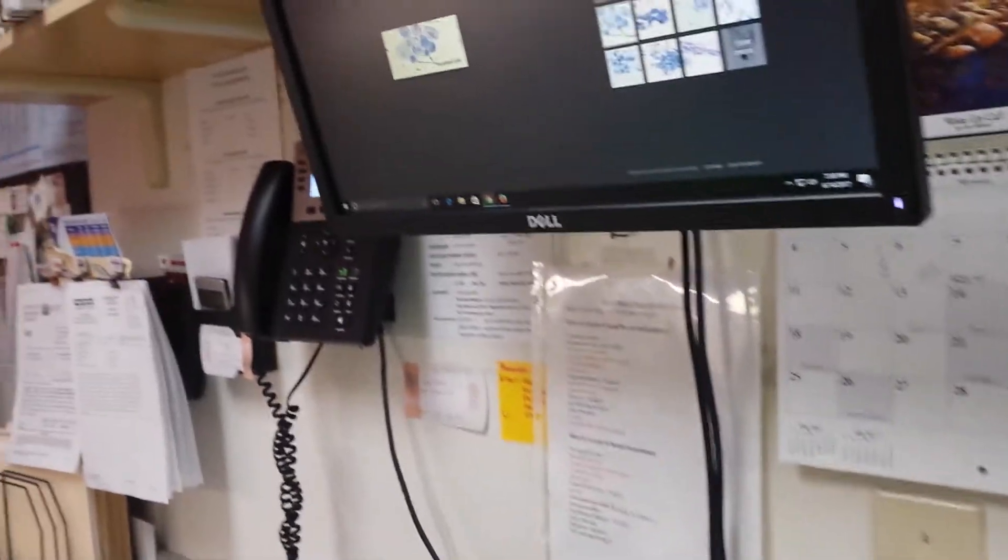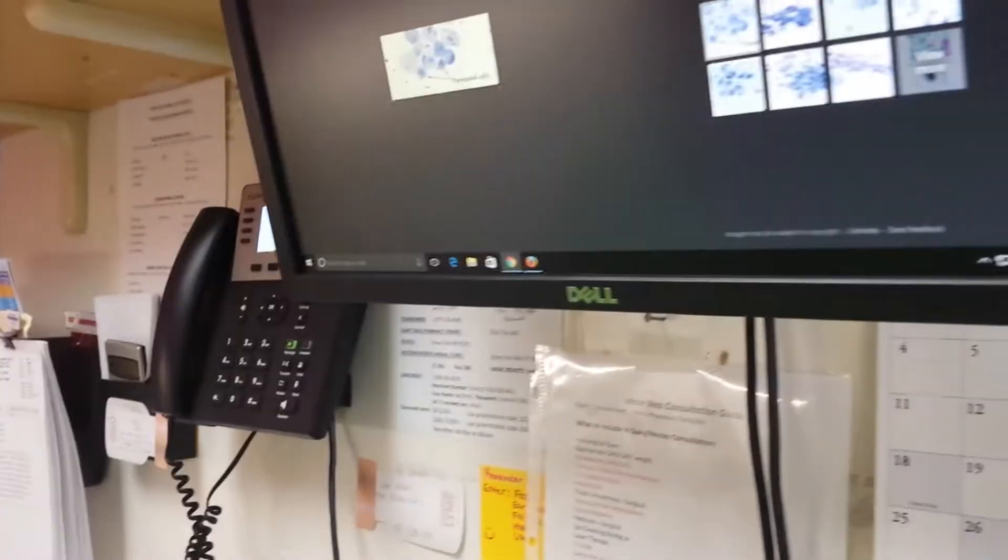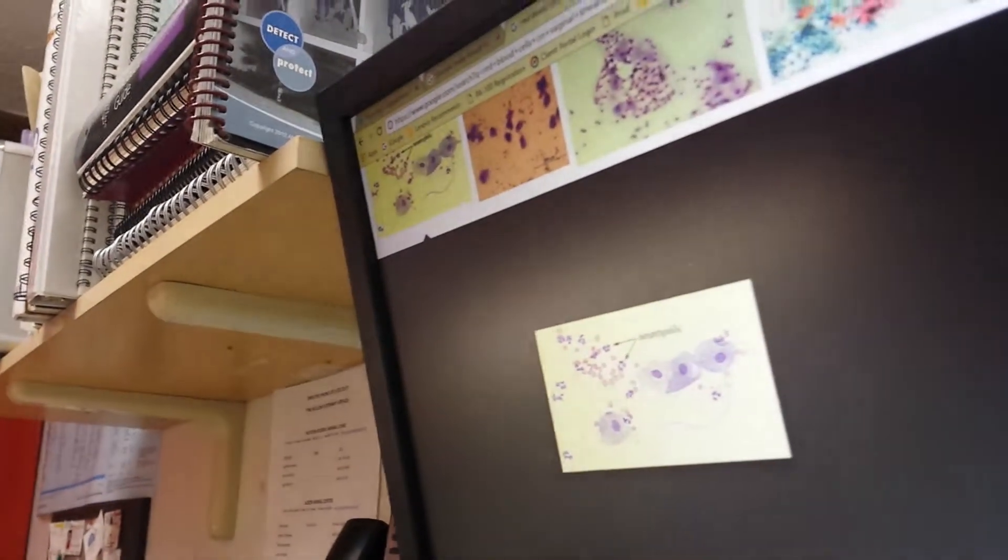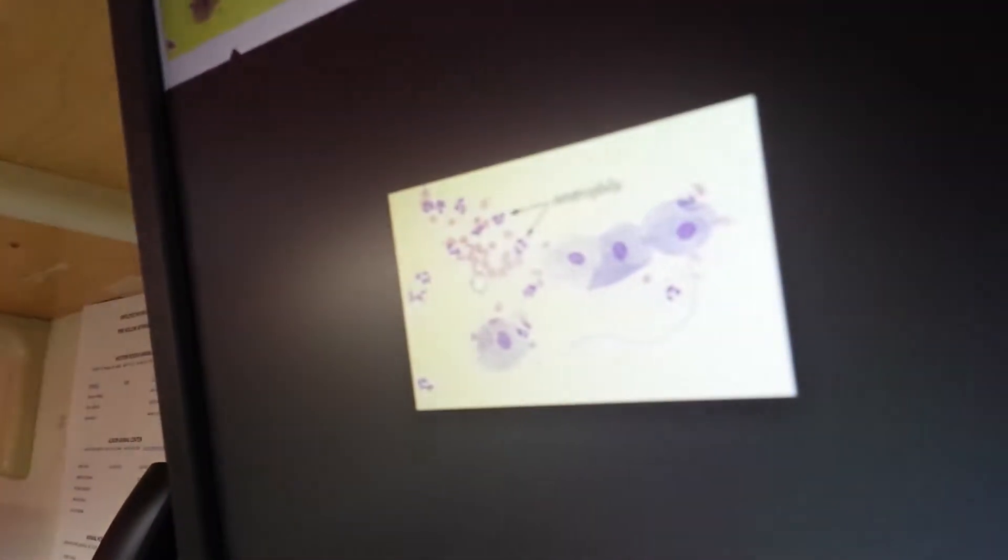We'll go ahead and let the doctor know what we're seeing, and then we're going to come over to the computer and just look at a few of the things that you will see on a typical slide. So we are seeing a lot of the epithelial cells on there, and then some red blood cells. We didn't see any white blood cells today, just the red blood cells.